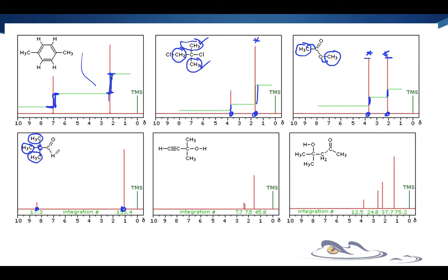This hydrogen is bonded to a different environment, and it's only 1 hydrogen bonded to this carbon, and this carbon is bonded to a double bonded oxygen up here, which is definitely going to cause a large shift to that hydrogen. So 2 environments, yes, there are.